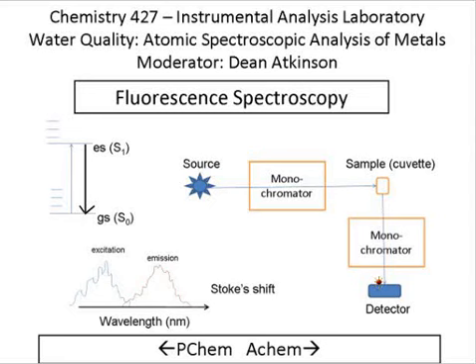striking the detector. So one of the really good things about this experiment is we really, in general, will only see light that's created as a result of this event. We shouldn't see light that came from the source and made its way to the detector. So the only light we should see is as a result of this fluorescent event. The thing that strengthens that argument is the rest of the cartoon over here.